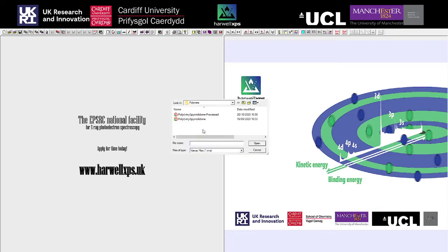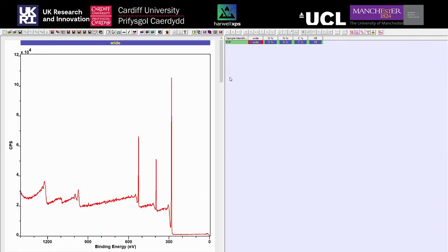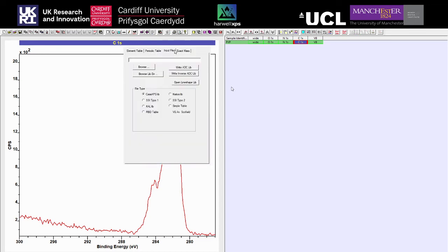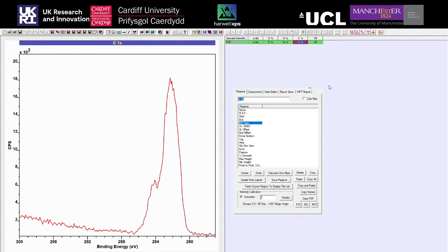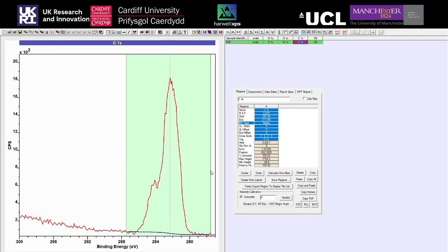I'm going to open up an example - we've got a polymer here, polyvinylpyrrolidone. We're going to work through as we normally would, starting by going to the library and making sure we've got the right library file. It's good to get that in at the start instead of realizing at the end that you've forgotten and then having to go through and change all your sensitivity factors. We'll create our region with a Shirley background across this - it's not too noisy, so we're happy with our region and background for the carbon.